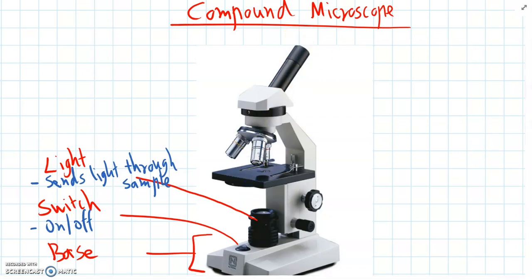So moving up from the base we have the back section here. And this section is called the frame. So it holds up the rest of the microscope.